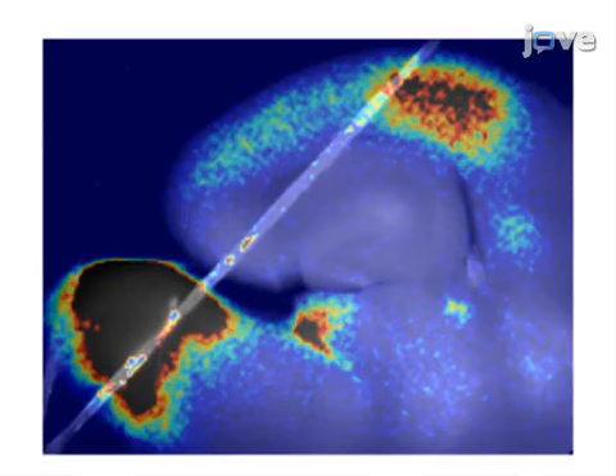Ultimately, the brain slice containing the colliculothalamal cortical connection can be used for a variety of experiments to better understand information processing in the auditory regions of the mid and forebrain.